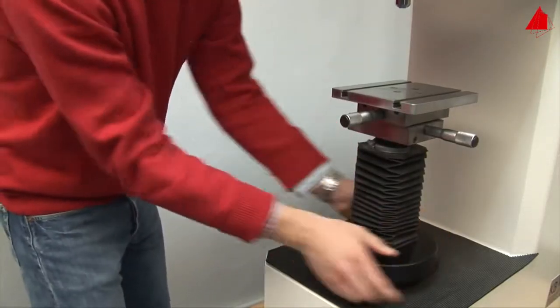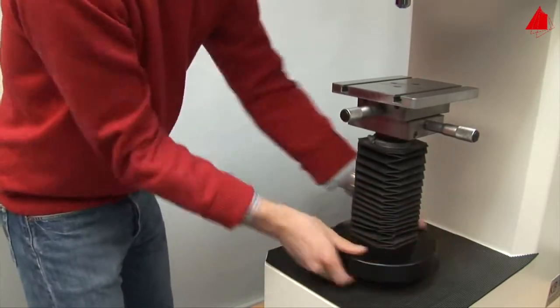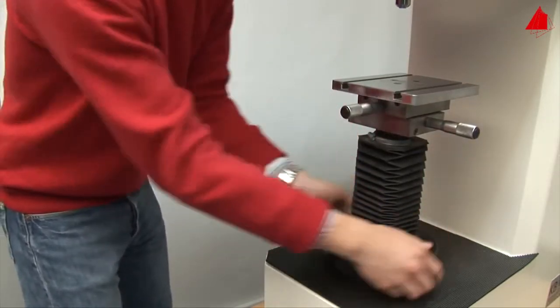The support table can be adjusted in height, so the test piece can be positioned at the correct distance to the microscope lens and the indenter.